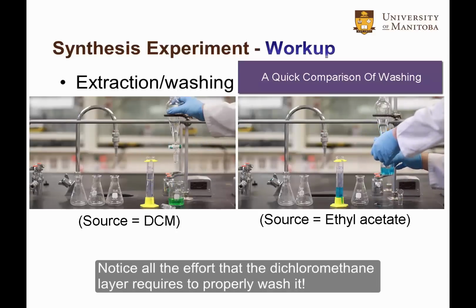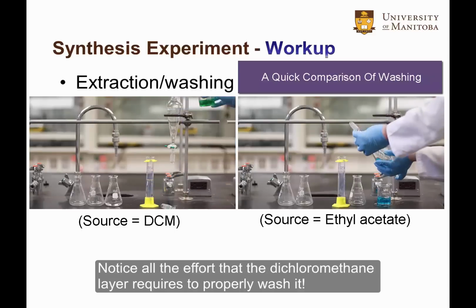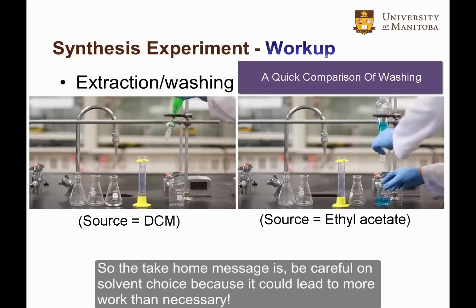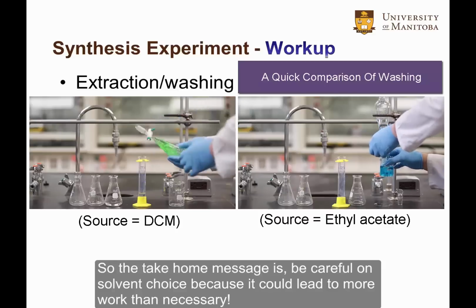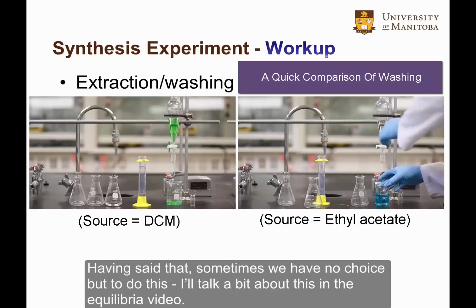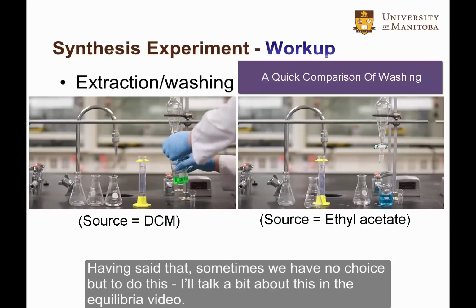Notice all the effort that the dichloromethane layer requires to properly wash it. So the take-home message is, be careful on solvent choice because it could lead to more work than necessary. Having said that, sometimes we have no choice but to do this. I'll talk a bit about this in the Equilibria video.